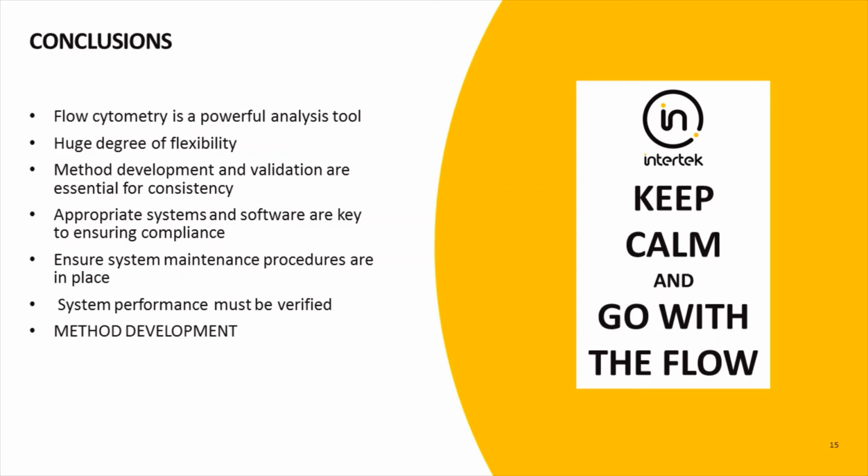To ensure that data generated will stand up to regulatory scrutiny, with such a wide range of parameters that can be modified, it is crucial that the system being used has audit trails and is 21 CFR Part 11 compliant. At Intertek, we achieve this with our FACSLyric instrument. It may seem trivial, but it's extremely important that the system maintenance procedures are in place to keep what is quite a complicated system functioning correctly. Again, we use the BD CS&T beads to make sure our instrument is performing consistently.